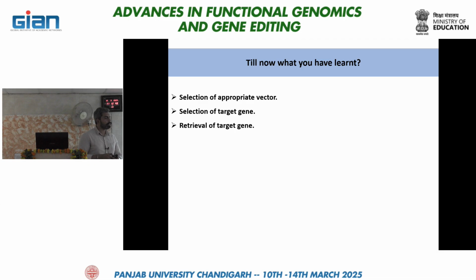So for Solanaceae, it's Sol Genomics, and for potato, it is SPUD. And for Arabidopsis, you must have known TAIR. Tobacco, tomato, you can easily find in Sol Genomics.